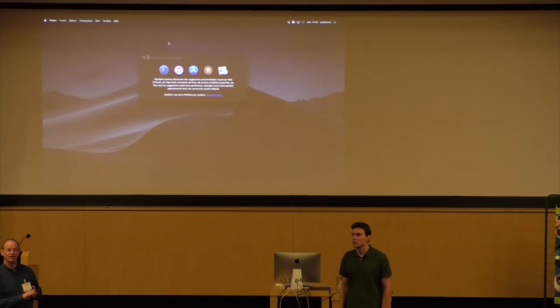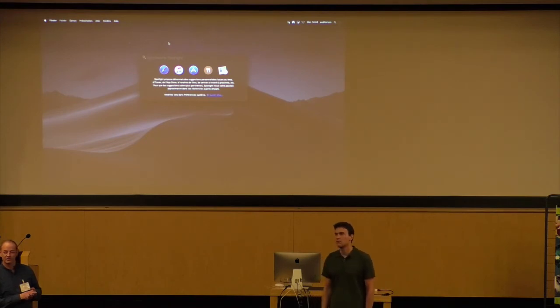Back to the writing on the grids. If I look at Quantifoils in an SEM, you basically see that the grid square is a little bit of a well, because they put the carbon on the round side of the grid bars, whereas Protochips puts it on the other side, on the flat side. Have you tried both types of grids, and do you see a difference? Between Quantifoil and lacey, or what? No, Quantifoil and Protochips, C-flat.